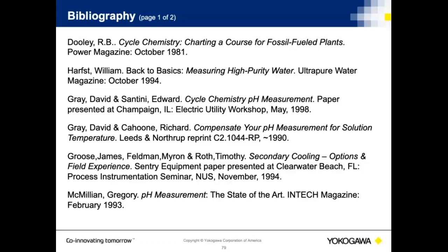Thank you. Okay, next question: is it more accurate to take a pH reading at a process temp of 154 Fahrenheit or to take a grab sample and cool it?